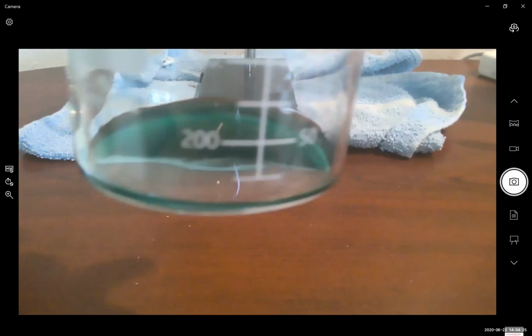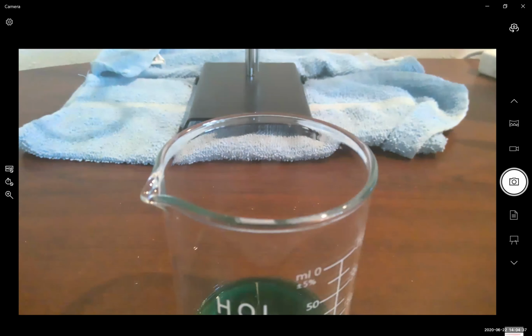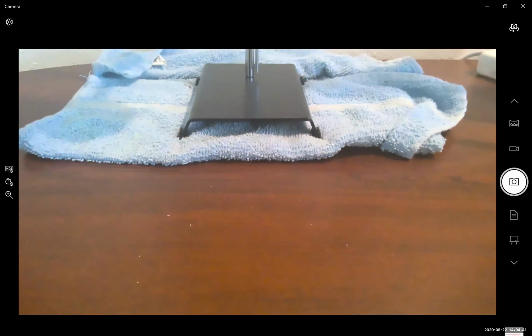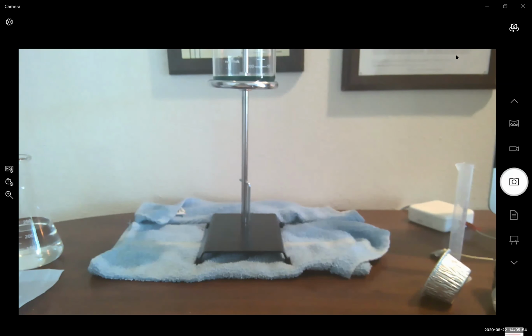We have our solution of copper gluconate, and now we are going to place the copper gluconate onto our ring stand. Allow me 1 second to find a boost so that the camera can show during this heating process. Okay, so here's our complete ring stand setup. We have our copper gluconate solution on our ring stand. Our ring stand is secure on a level insulated surface. We have the area completely free of any other flammable containers or objects. Move this a little bit forward.